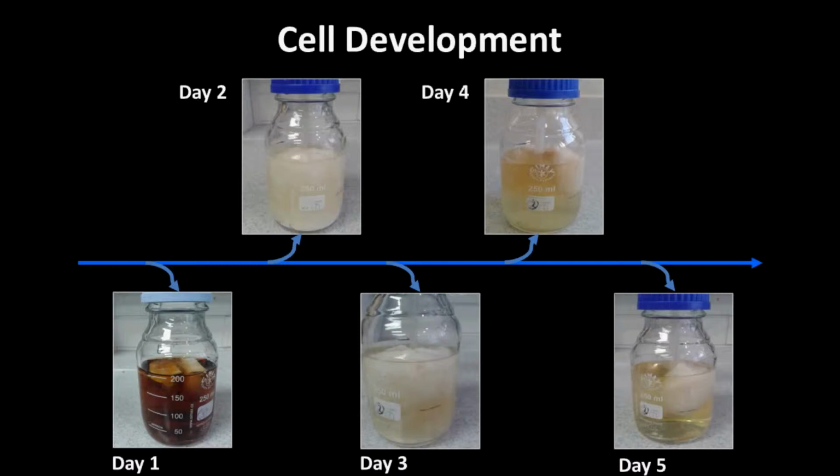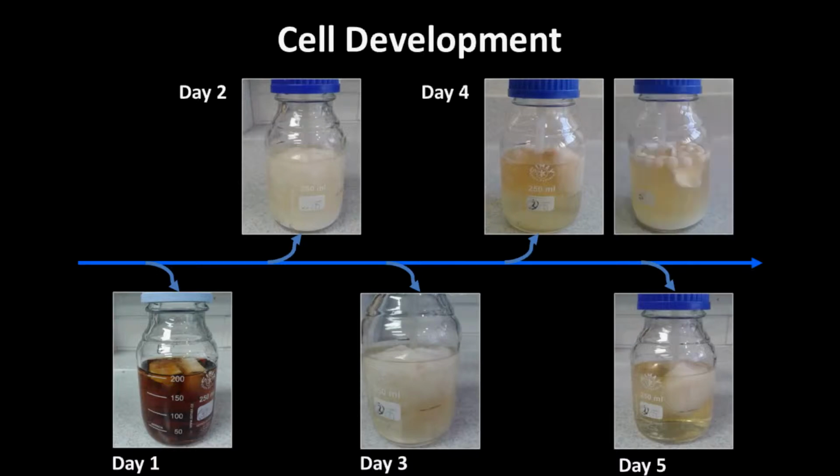The cell development is as per the following pictures. You can clearly see that the solution clears up as the fermentation proceeds. This is because the neutralizing agent gets consumed. For one citrate concentration, 2 grams per liter, a different cell formation was observed. Pellets were seen to have formed instead of the usual mycelial cell development. This was a clear indication that citrate has some sort of influence on the cell development.